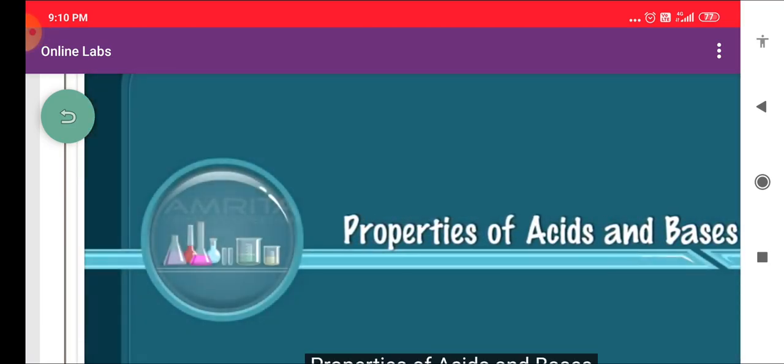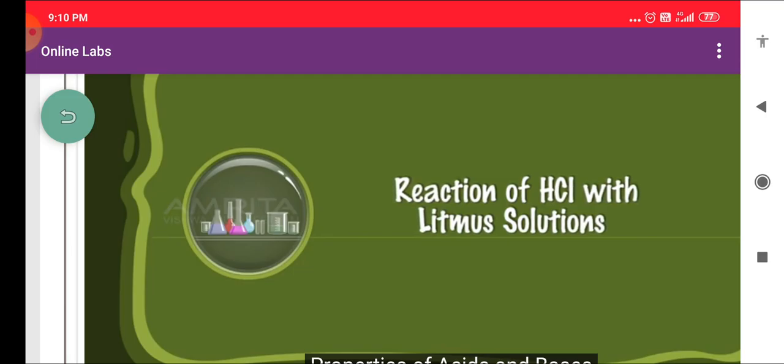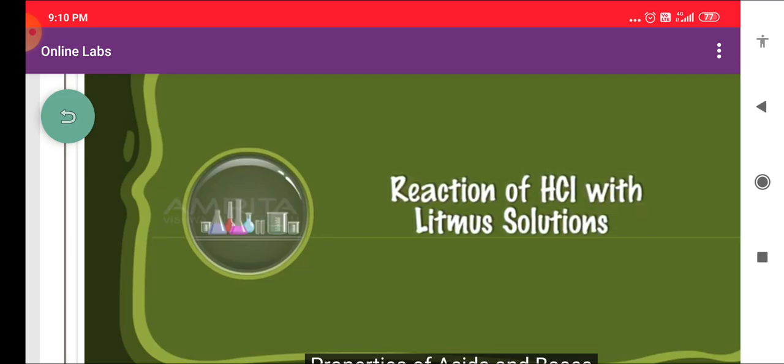Properties of Acids and Bases. Reaction of HCL with Litmus Solutions.